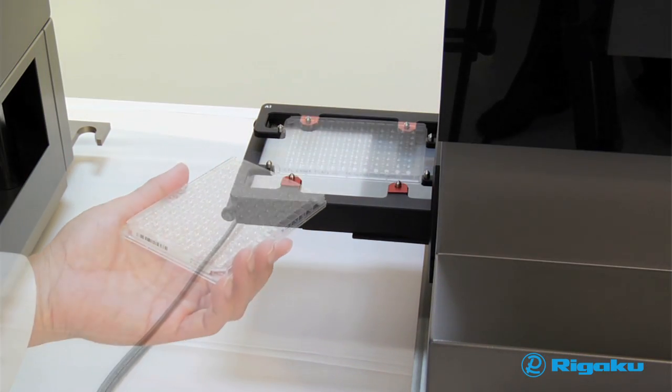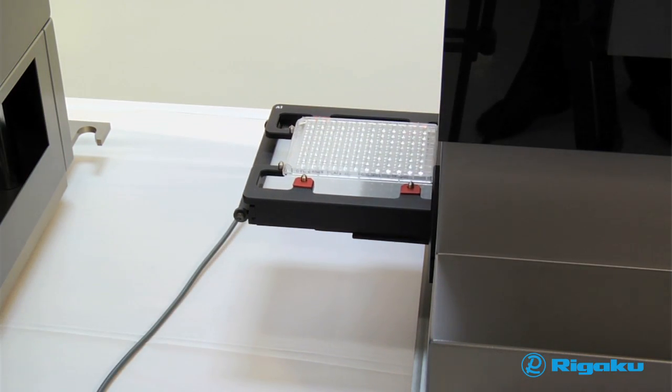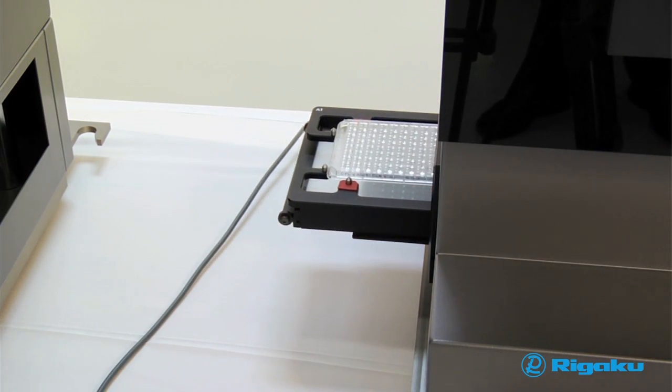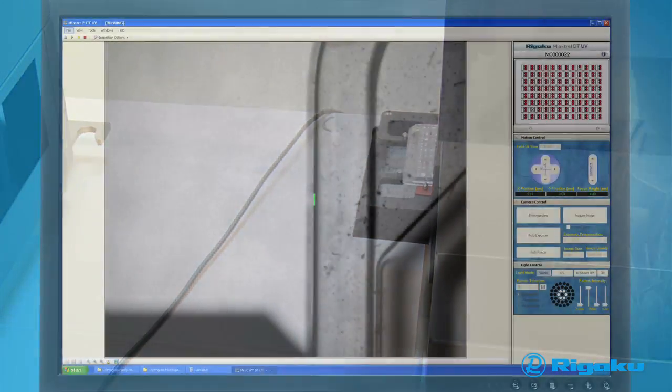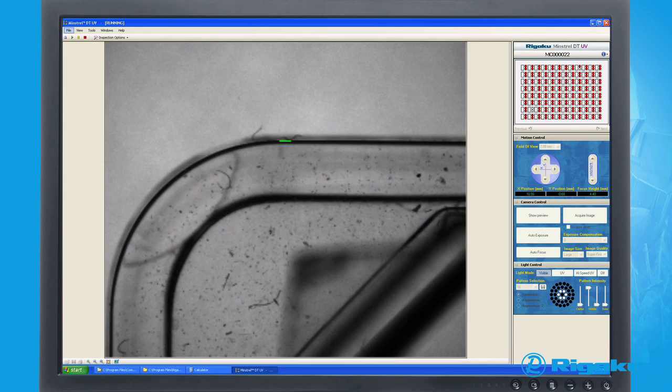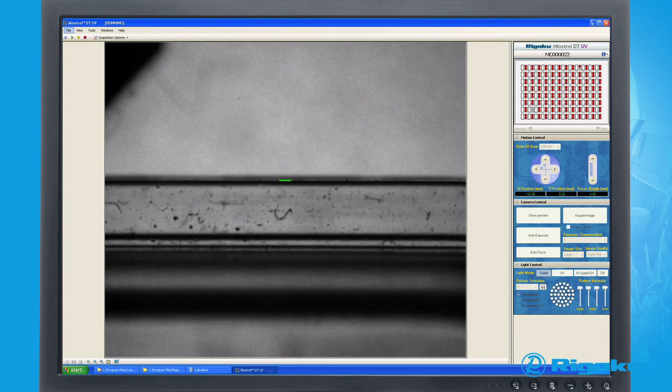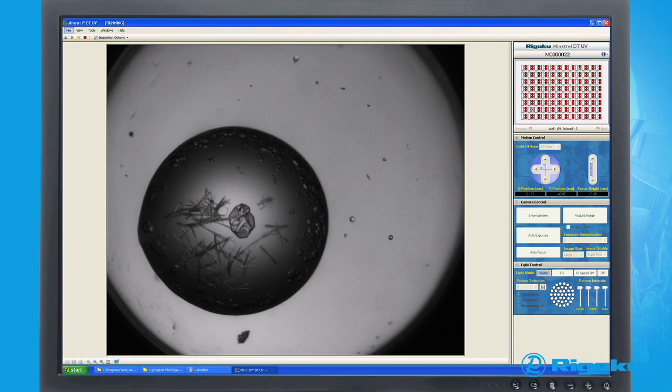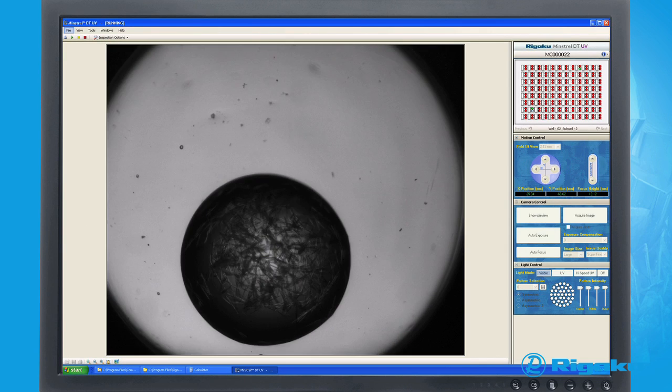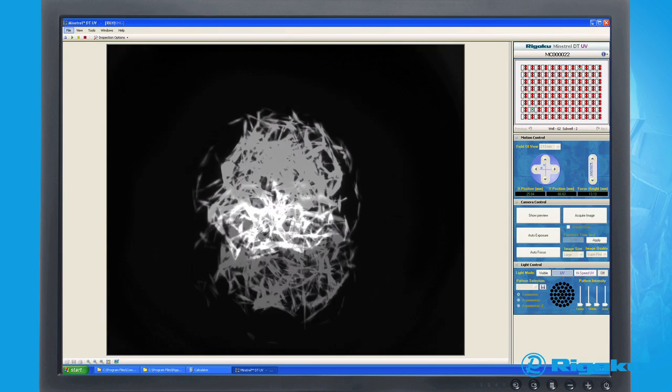Simply place your plate into the Minstrel DT UV and the system will automatically scan and image the entire plate based on predefined imaging options.